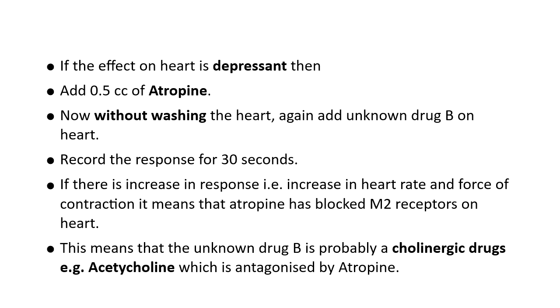If there is increase in response, that is, increase in heart rate and force of contraction, it means that atropine has blocked M2 receptors on heart. And drug B is probably a cholinergic drug, for example acetylcholine, which is antagonized by atropine.